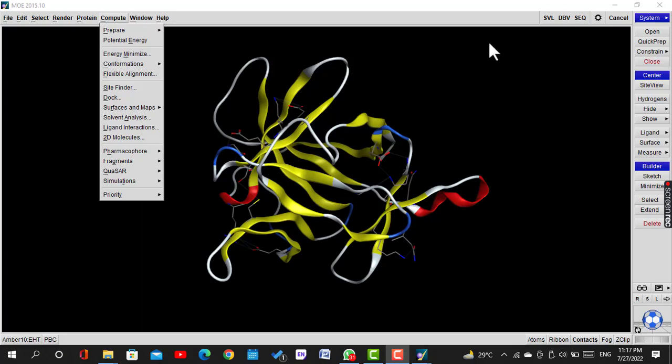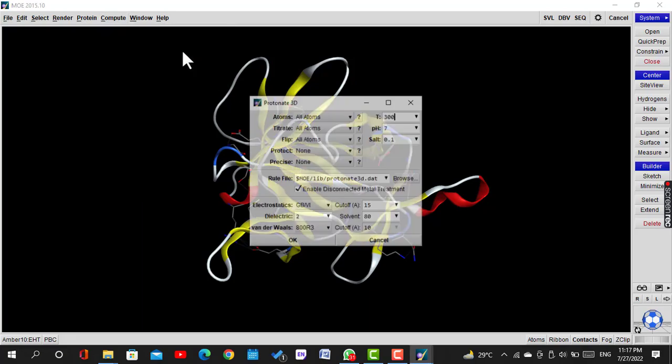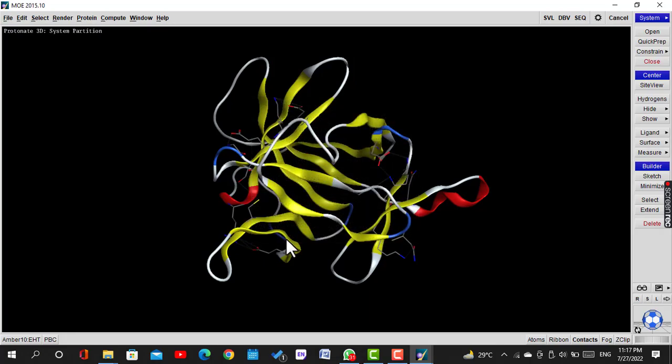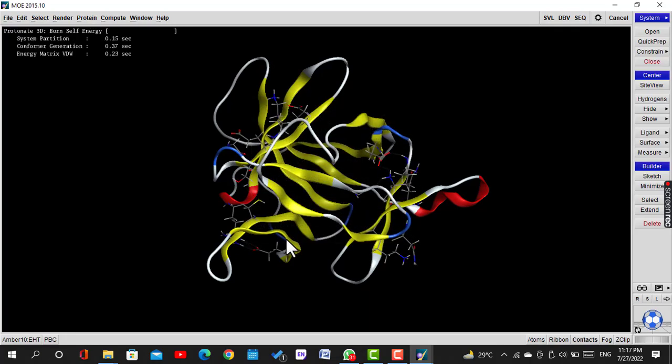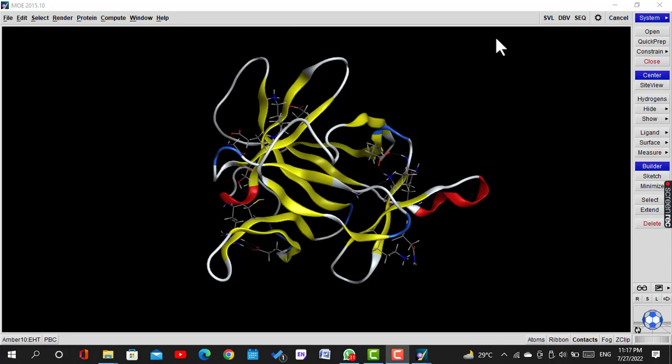Now click on Compute, click on Repair, then Protonate 3D, and then click. A new window will be opened. Click OK with default values.